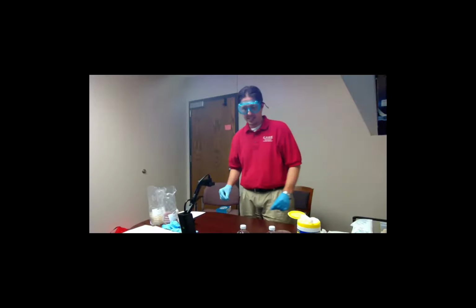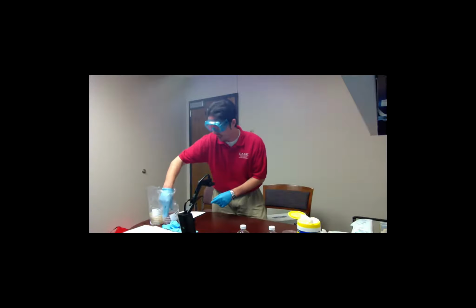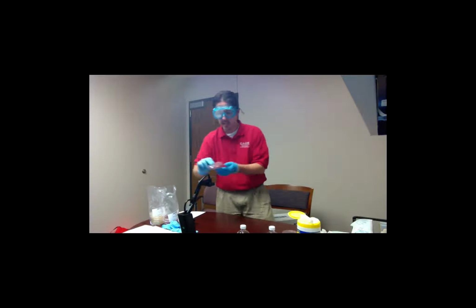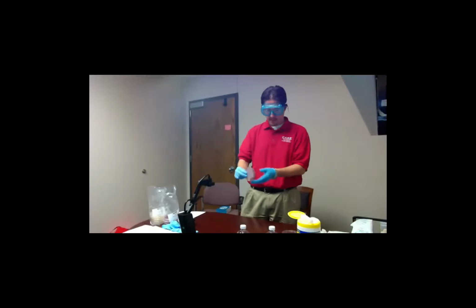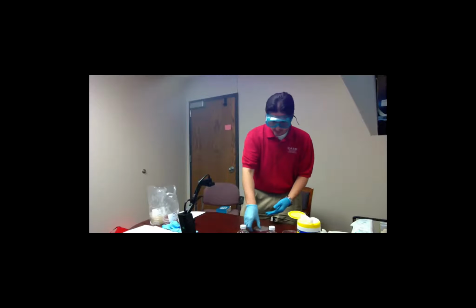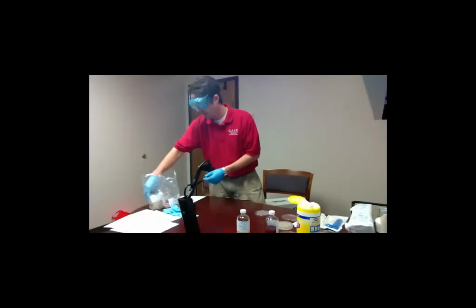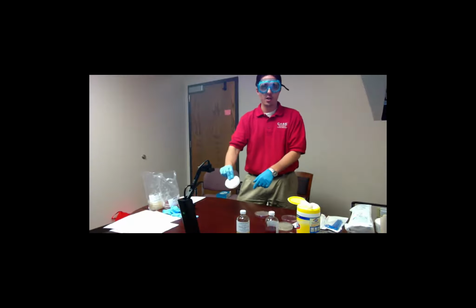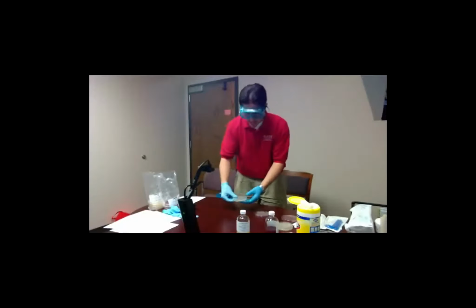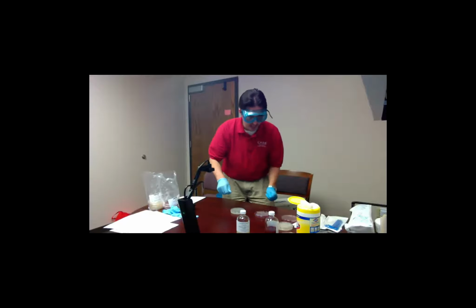Yes, it does. Okay. So basically, what you're going to do is you need to get your MacConkey agar, the dark red or purple plate. You can set it on the ground. You've already bleached your surface. You have your gloves on. You have your safety goggles on. Same thing, your clear white one, that's the nutrient agar that grows general bacteria. And you're going to set it lid side up. So you set them on the ground.